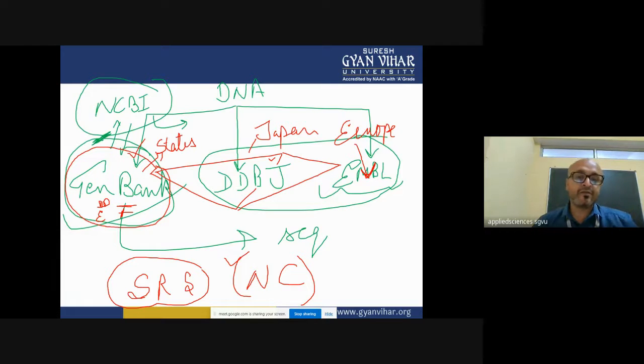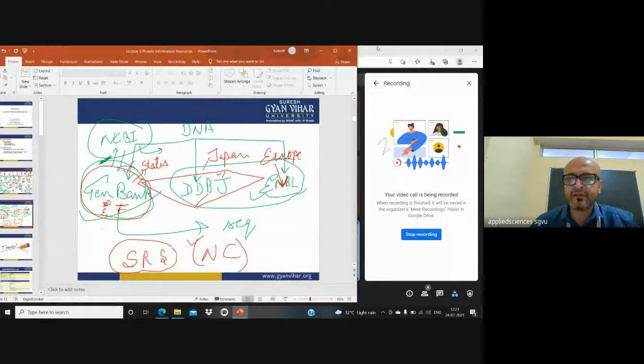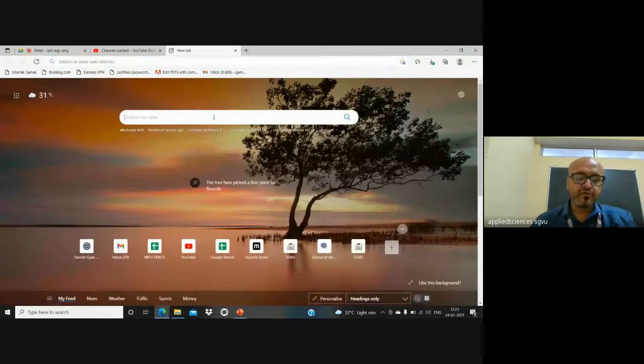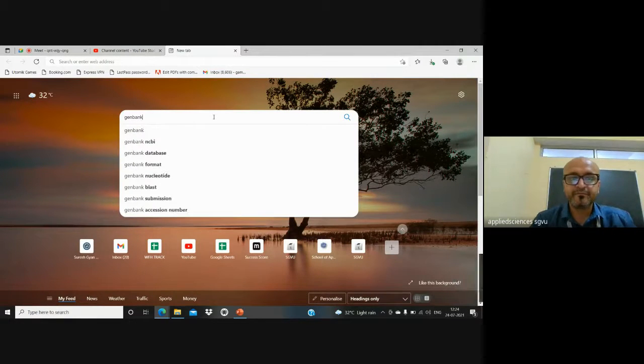So let us not waste much time. Let us directly go to the principal page that we want to study, the GenBank database. To open GenBank, I'm not doing anything extra. I'm just writing GenBank. Please remember, it's not GeneBank, it's GenBank.